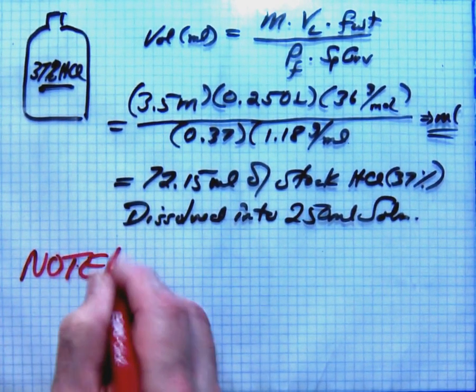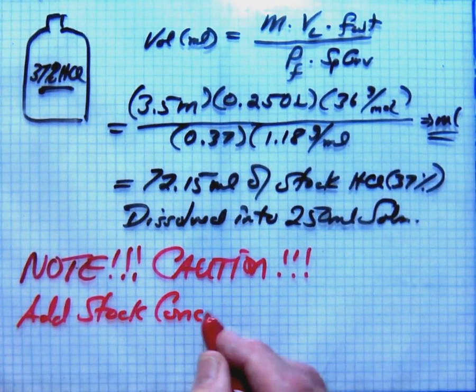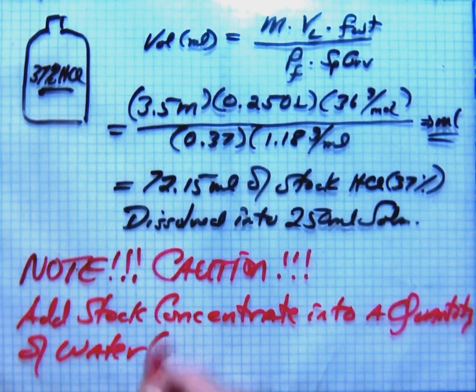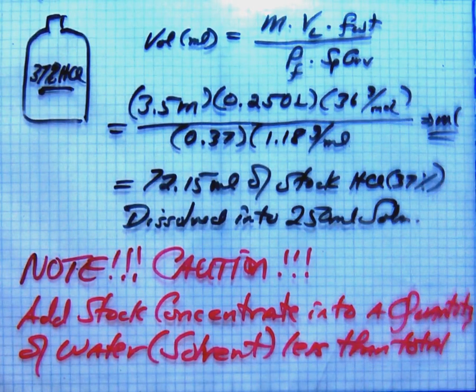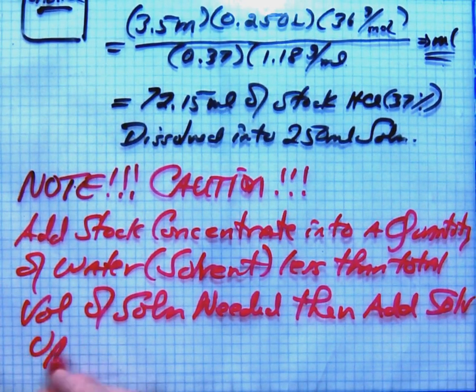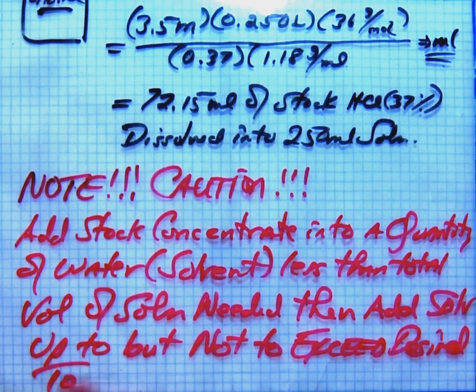Note, caution: add stock concentrate into a quantity of water solvent less than the total volume of solution needed, then add solvent up to, but not to exceed, the desired volume, total volume.